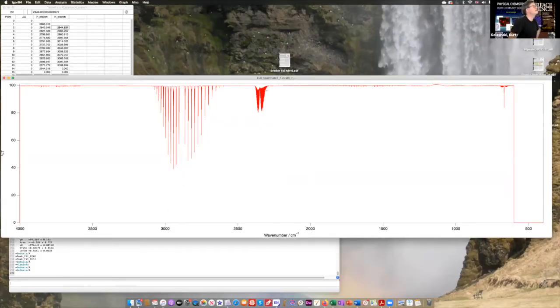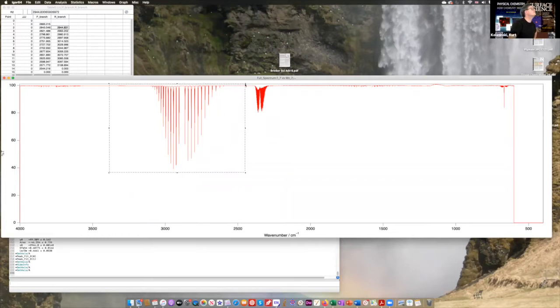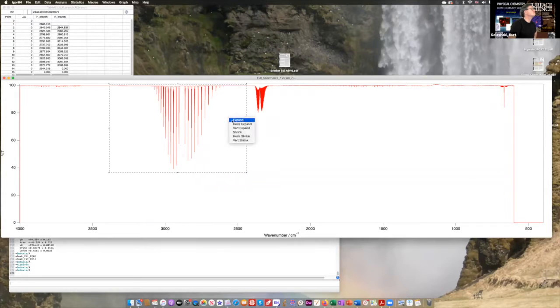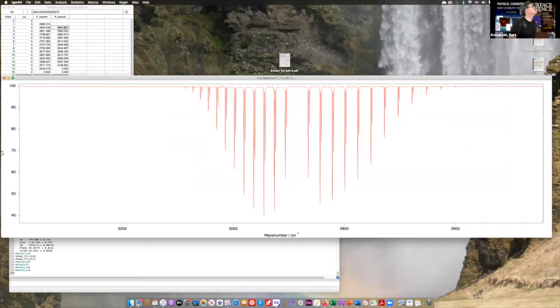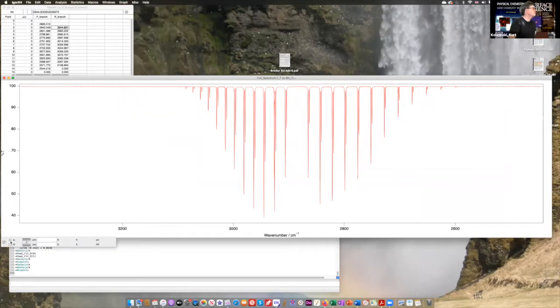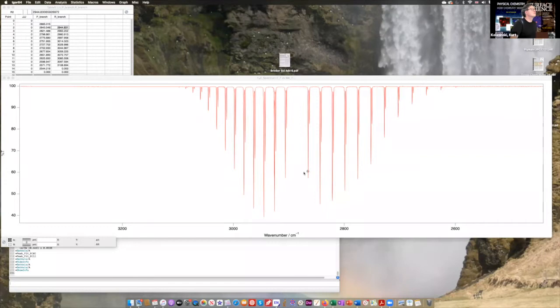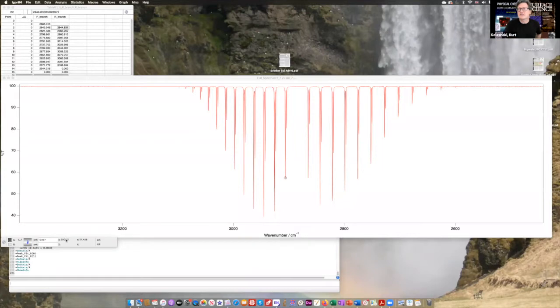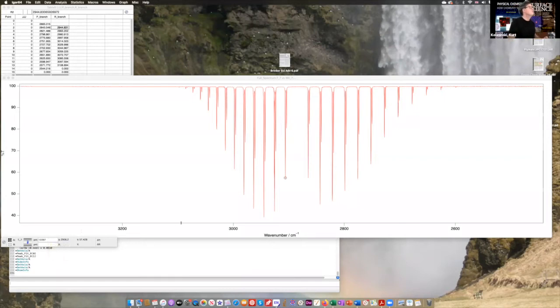We've got this really nice data, we have some impurities, we've got the HCl region — let's concentrate on that. We expand that region. Now we want to find out where all these peaks are. One way you could do that is to show Info, get the cursors, and place a cursor on top of a peak — you can just drag and drop it or move it around with the arrow keys.